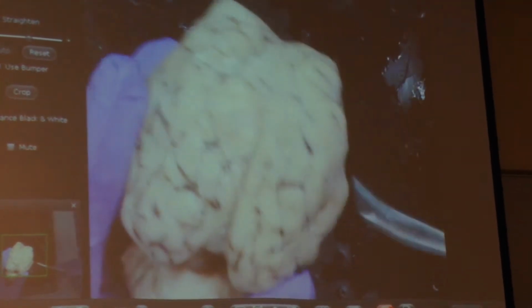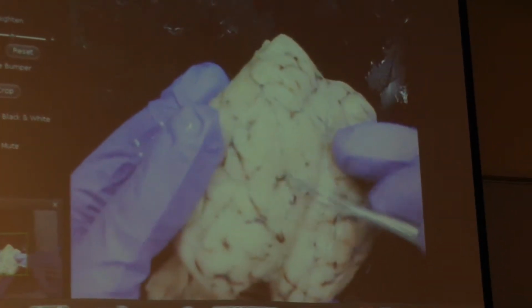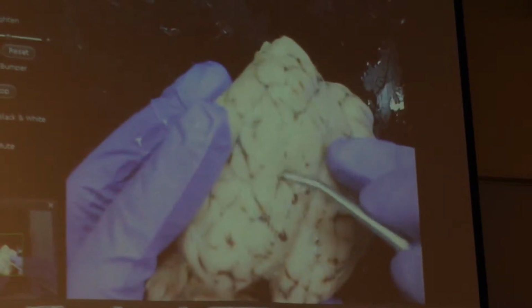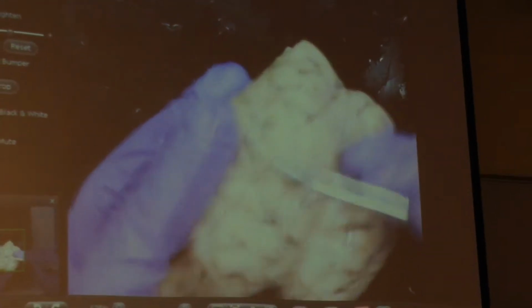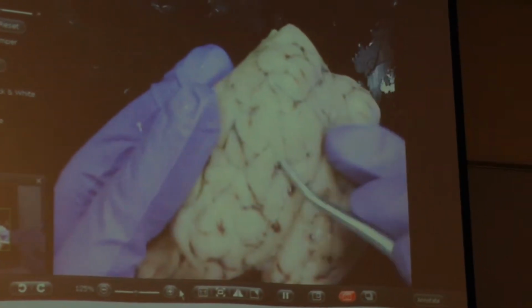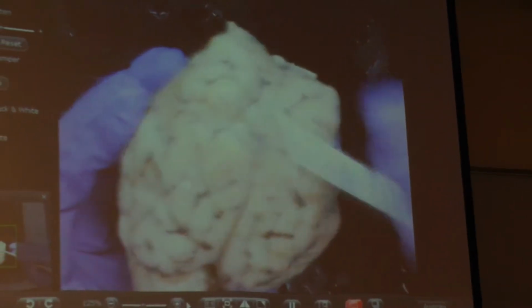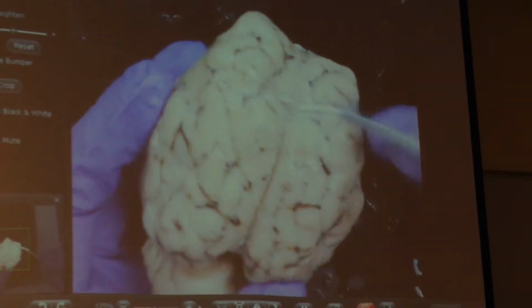Instead, what we see is arachnoid mater, and here's how you can find your arachnoid mater. Just go into one of the sulcus or sulci, and you can put your probe in and see this transparent membrane that you can pop here. That is your arachnoid mater. Notice it looks like a spider because of those collagen fibers going throughout.